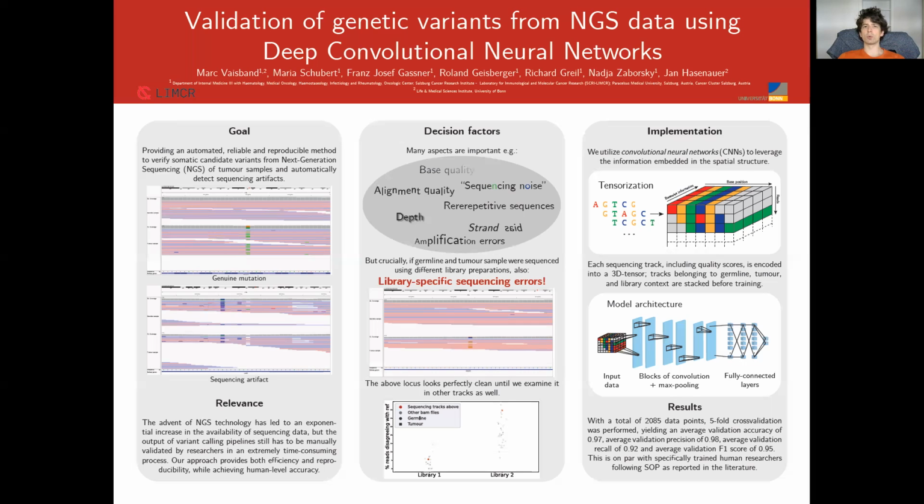So after formulating the sequencing data into numerical form, we feed the data which was previously manually annotated through a relatively straightforward model architecture, where we basically, in the beginning, have convolution blocks with max pooling every time in order to learn high-level features in some sense. And then the output is fed into just a fully connected classification head. This is a structure which is also frequently used in computer vision. As a result, we see that this performs quite well.